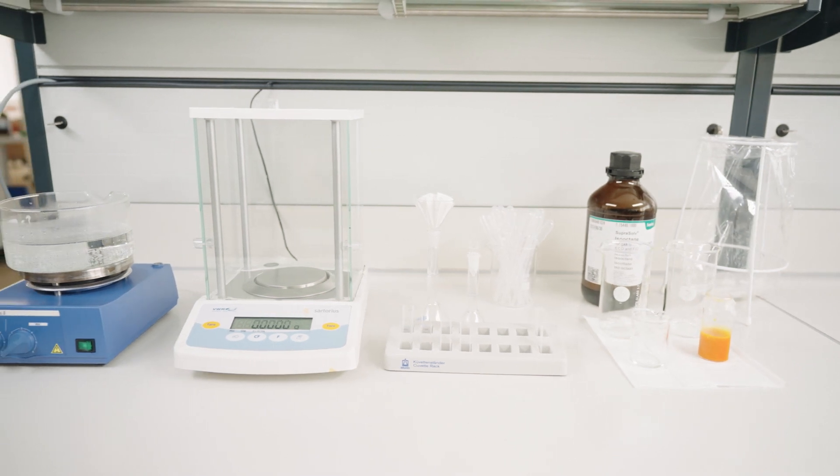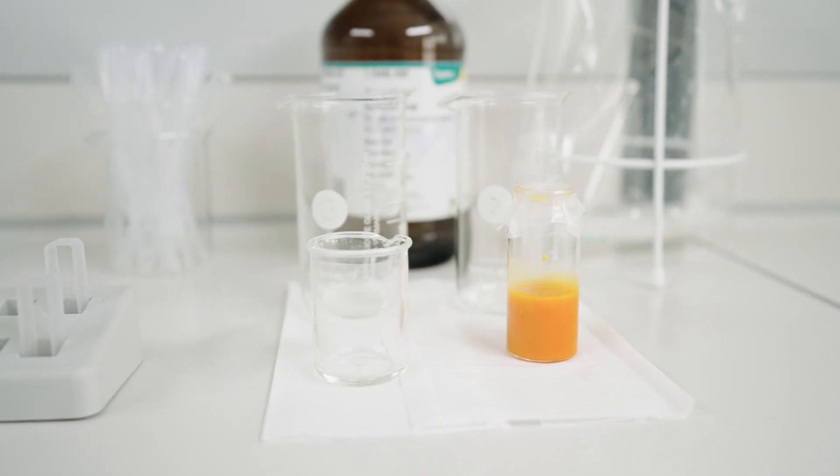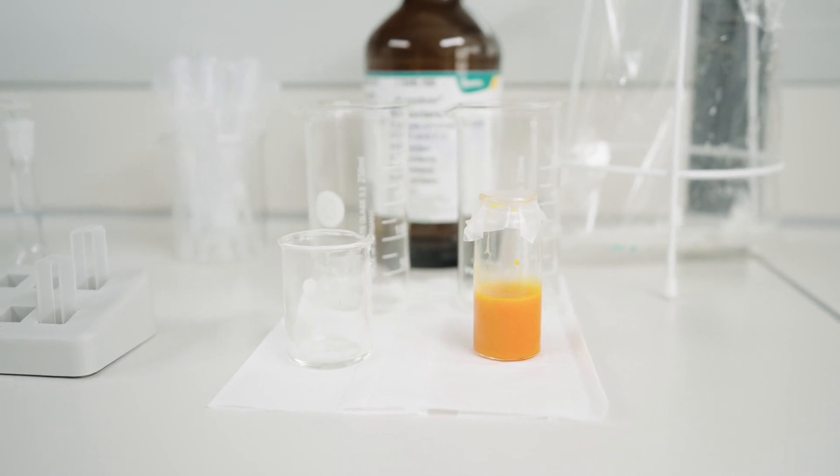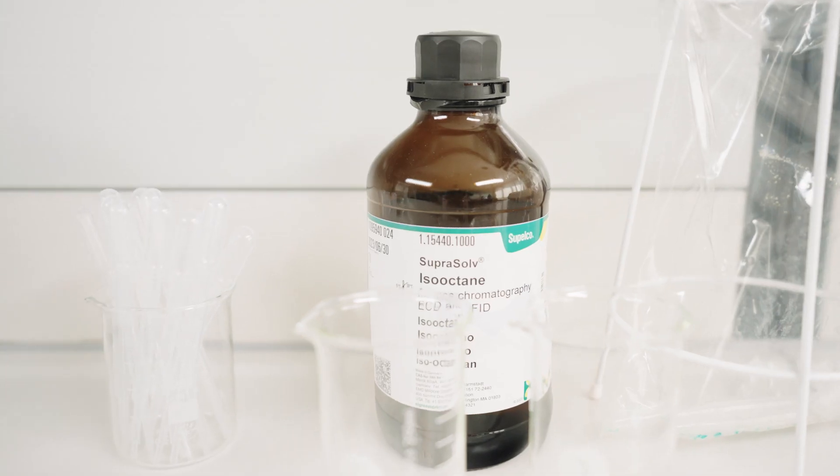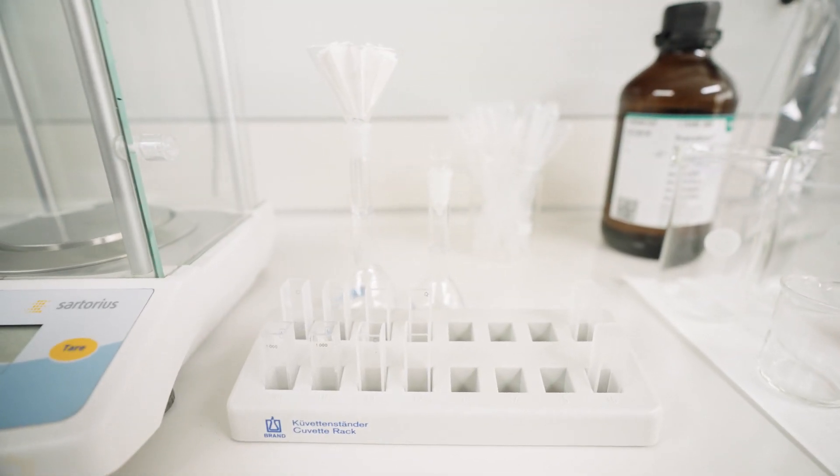We will start with the necessary materials. Besides the crude palm oil sample, we will require the following items. First, we need the spectrophotometer and also ISO octane. We will be working with high-quality optical materials such as quartz cuvettes. We urge you not to use low-quality solvents that could damage the optical surface. We will be using a 10 mm quartz cuvette.